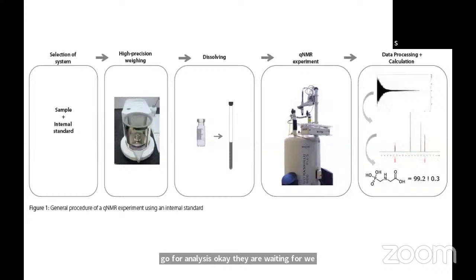Here also the same. And then once the weighing is done, prepare the sample, maybe in 1 ml or 2 ml as per the requirement, and then transfer sufficient quantity. Because when you are preparing a solution, you are already aware of the concentration of the sample. Let us say labeled claim is 500 milligrams. Let us say you presume 500 milligrams, and then you are preparing the solution of known concentration. Then you will be adding internal standard to that, of known quantity.